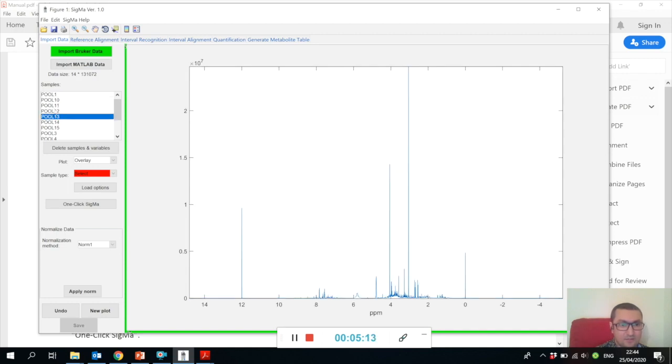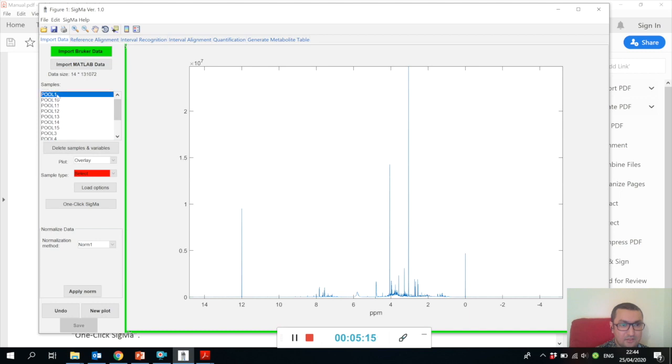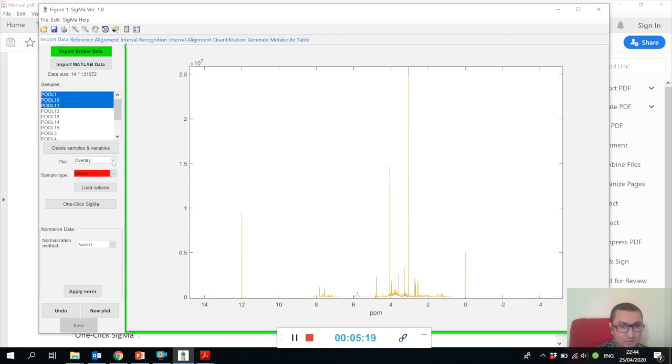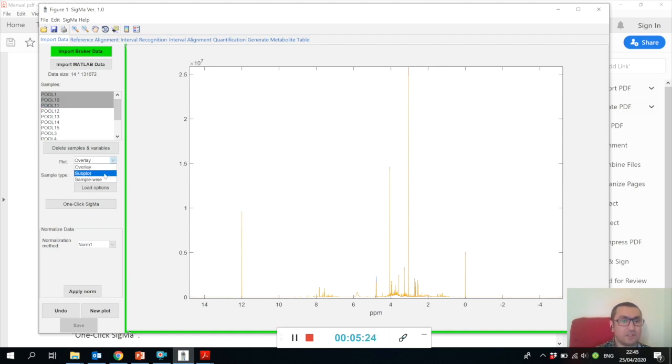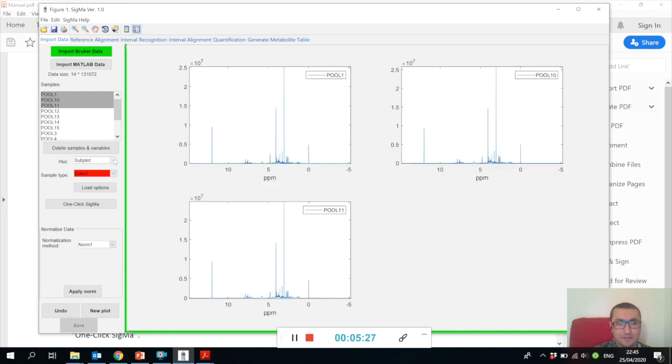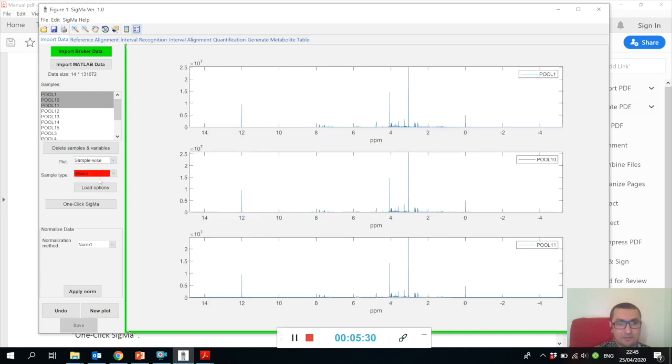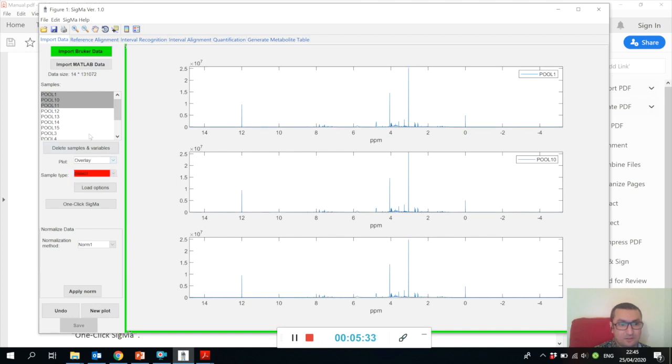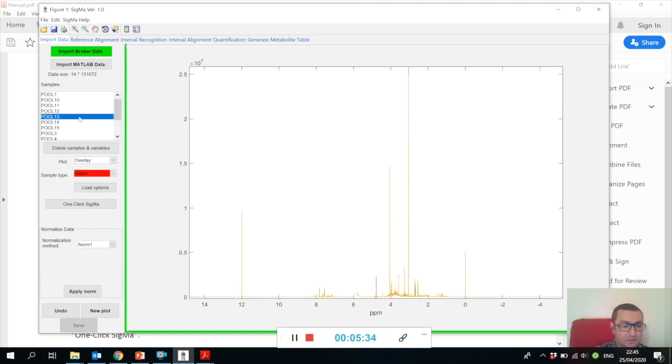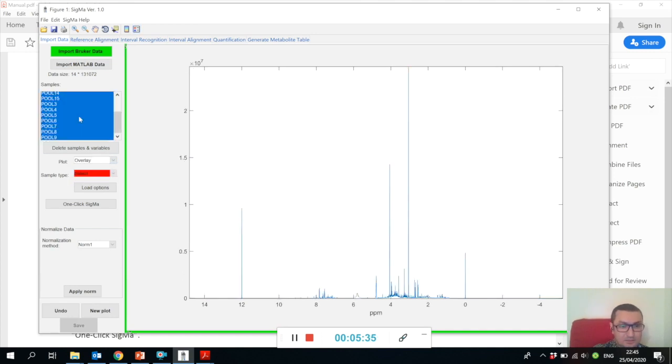You can select a few samples and here we have plot options. You can either look at all the plots superimposed, or you can do a subplot. You can even do sample-wise plots like this, and you can look at all the samples simultaneously.